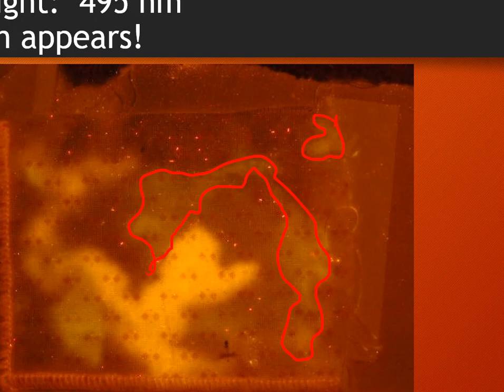Maybe it was so faint in color. Maybe it was so old that some of the color had gone away, but it's still showing up. But this is now the presence of something like semen, another body fluid that has been on this piece of fabric that I can identify and circle and say that it's there. So 495 is going to be the key player here. That gets cut off on your screen because I've zoomed in a little bit, but 495 nanometers.